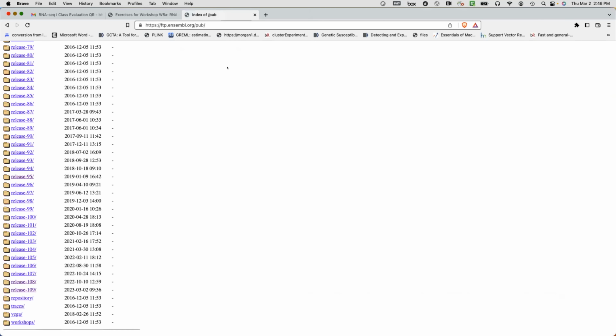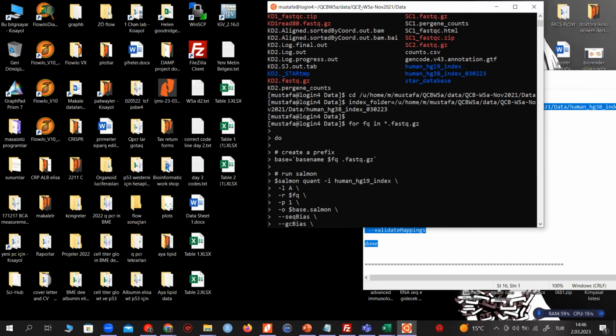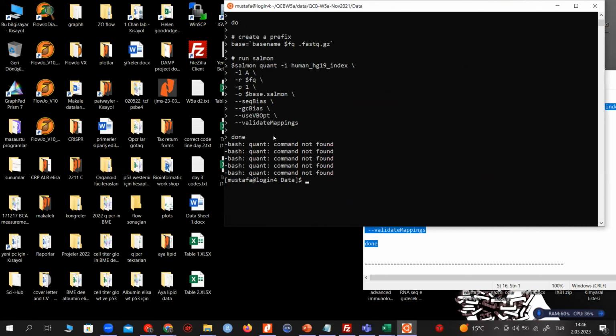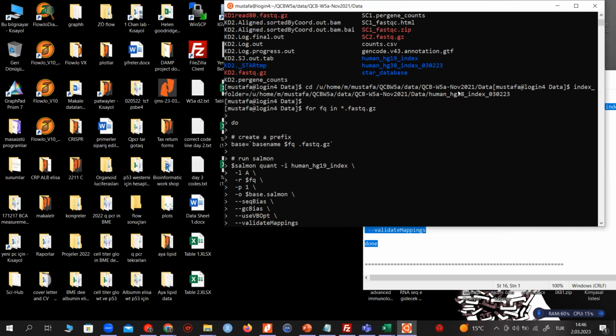Arjun, can I also share my screen? Yeah, go ahead. Let me stop share. I'm not sure what the problem is. It is not working. Did you define salmon properly? Yes, I think so.